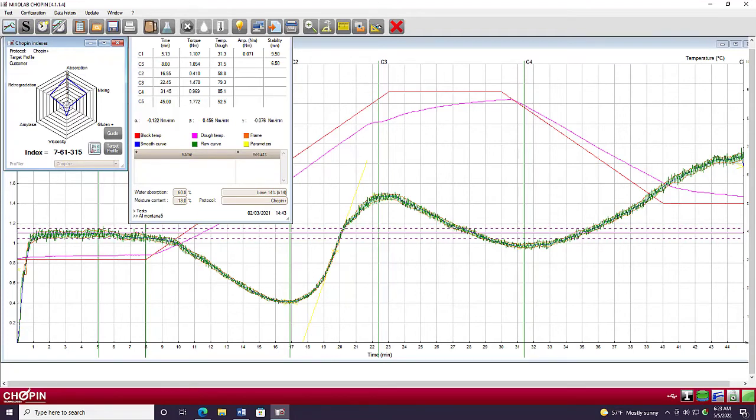And this will tell you how much water carrying capacity that flour has, how much water you need to put into that dough. It'll also give an indication of mixing stability. So this is really an indicator of how much processing that this flour can withstand.